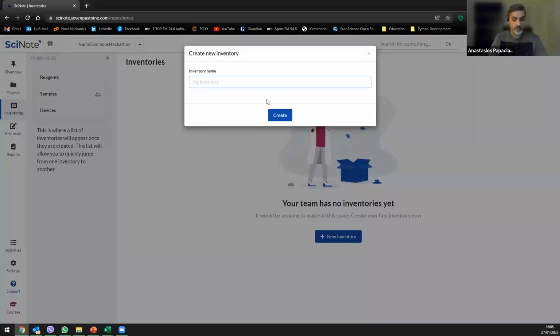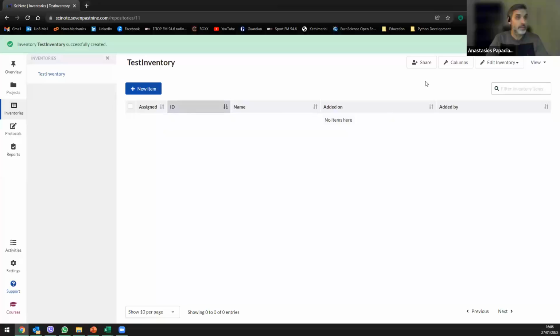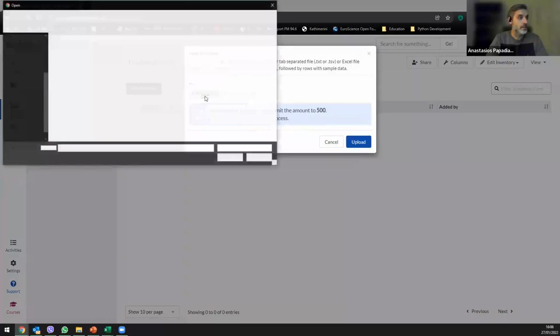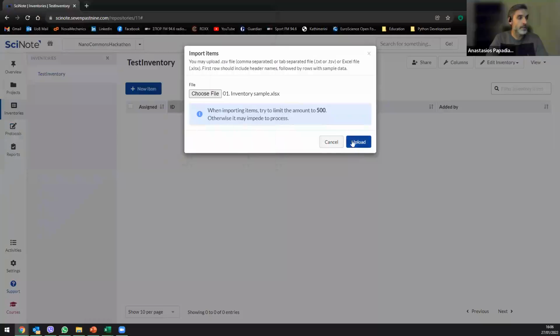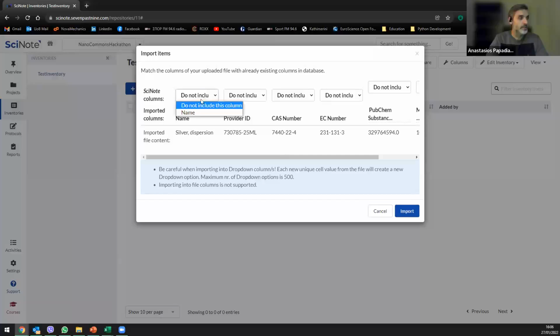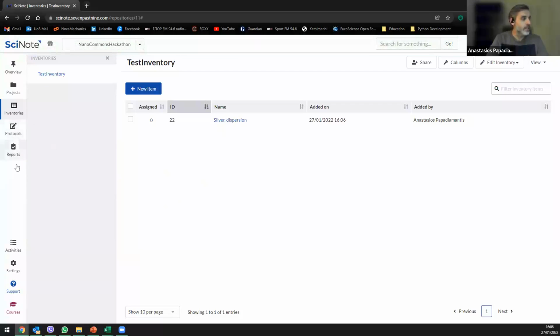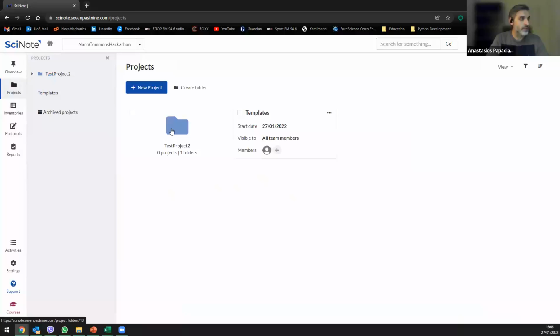Give me one second, please. I apologize for that. I'm doing it very fast now. Sorry, I did it in the wrong team. The inventory.